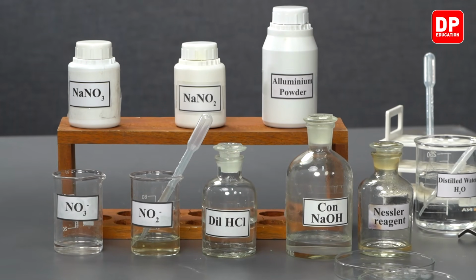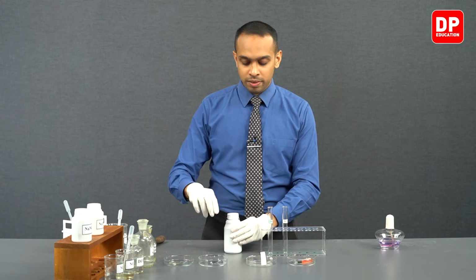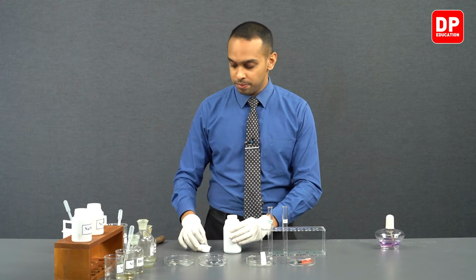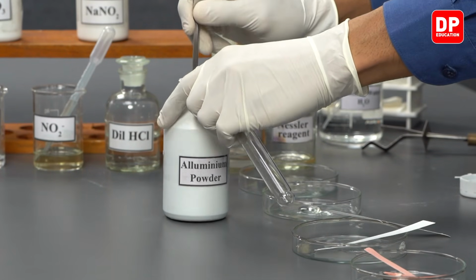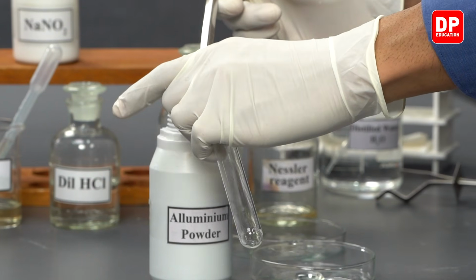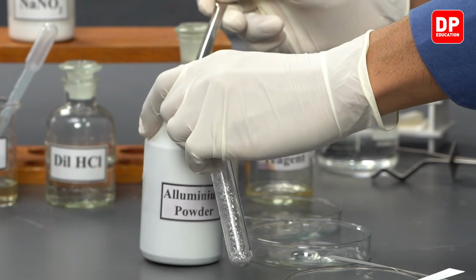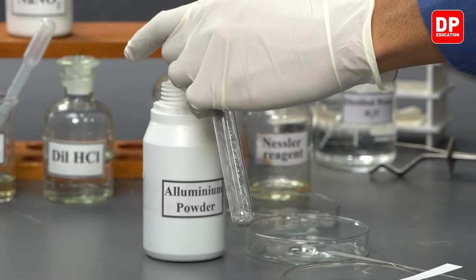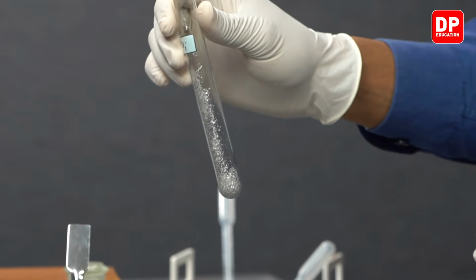So let's first take aluminium powder into our test tubes. We will take a small amount of aluminium powder into our test tube. This is mixed with pieces of aluminium as well.